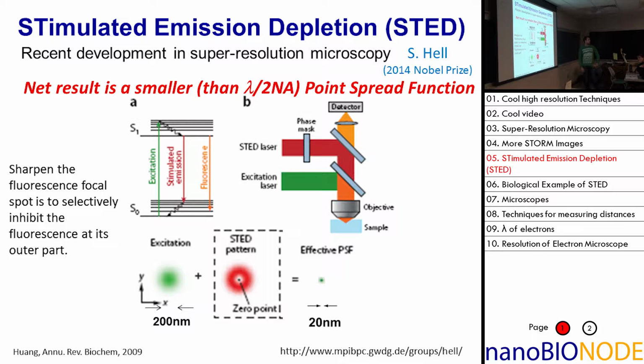They're ready? Well, we got an idea, I guess. Basically, we thought that the bottom mirror focuses the two lasers onto the sample, but then this top mirror, when they come back, filters out the combination of the two lights, and that combination that's getting filtered out is everything that used to be around here, which is why the only thing that gets let through is the green that was going through the hole in the red light.